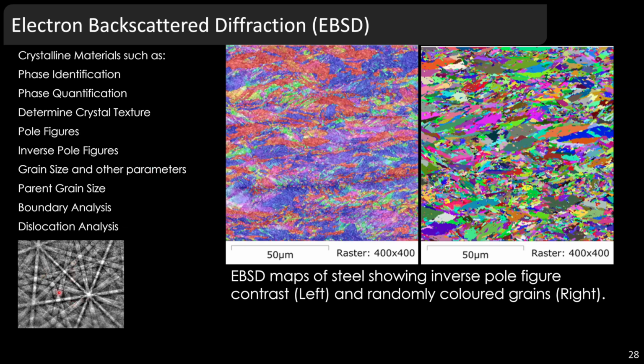We do have a fairly high resolution camera, so you can also do high resolution EBSD and collect the patterns if you want to do pattern analysis in a program. You'll have to supply the program though. It can be very useful, especially if you're doing a little bit of dislocation analysis or looking at strain within materials.